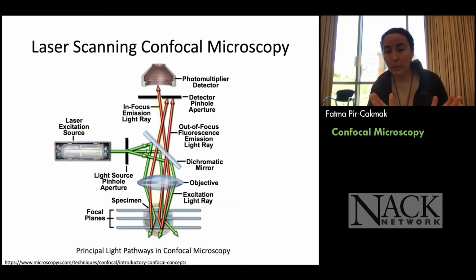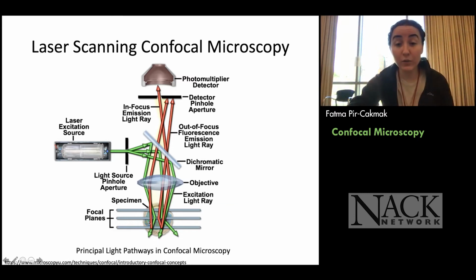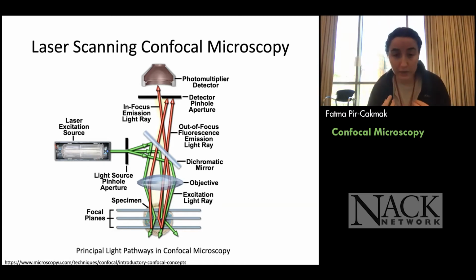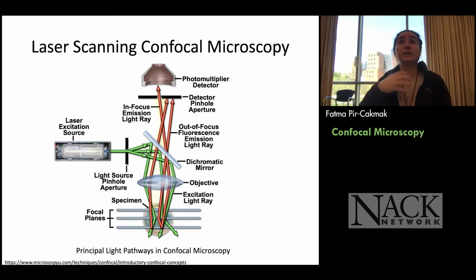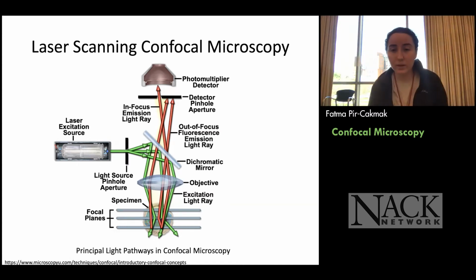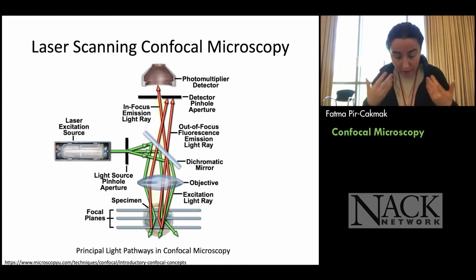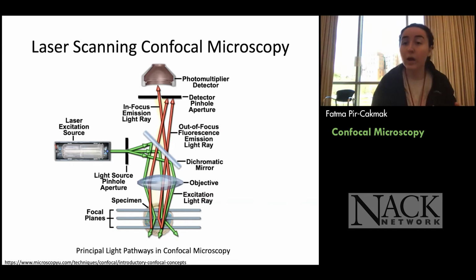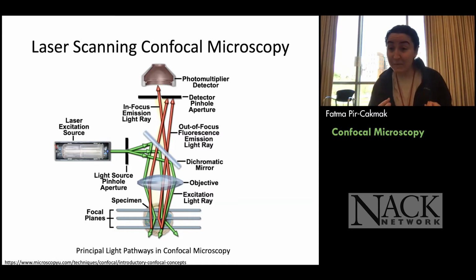If you think about it, you have your sample here, and you're exciting the sample with laser light, and then you're collecting this very dim signal coming out of your sample. All this dim signal is coming at the same time. If you look at your whole sample with epifluorescence, a regular fluorescence microscope, it will come all at the same time.